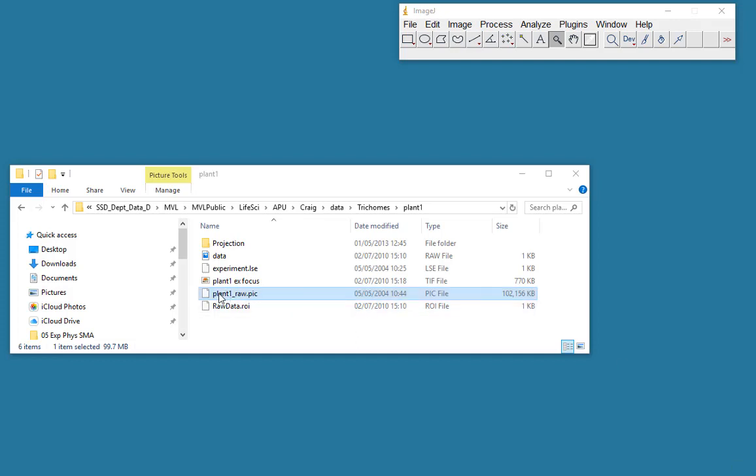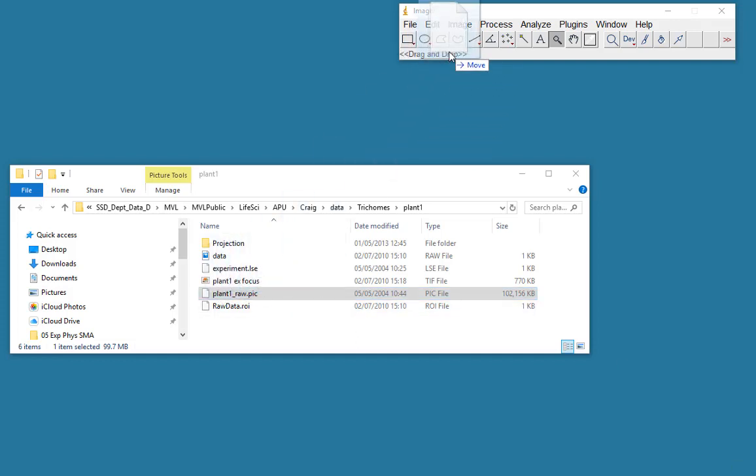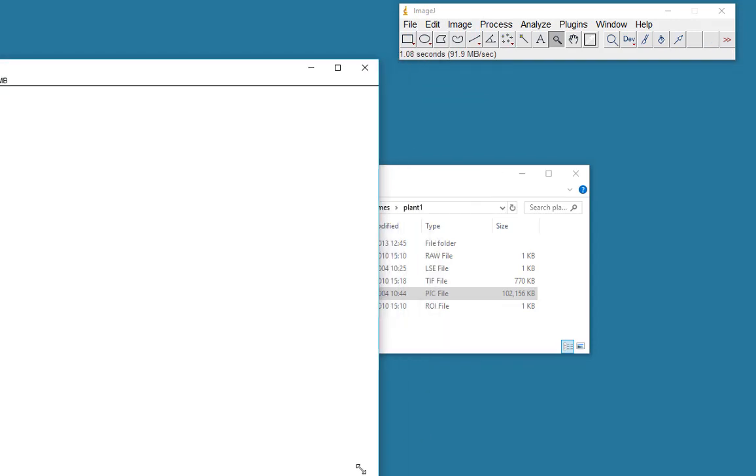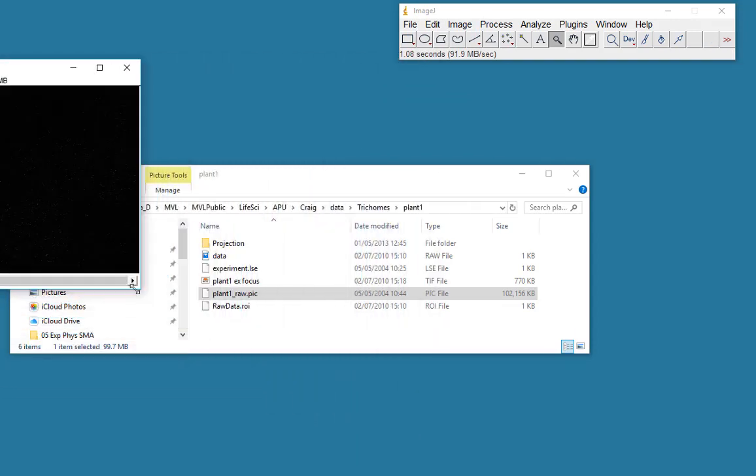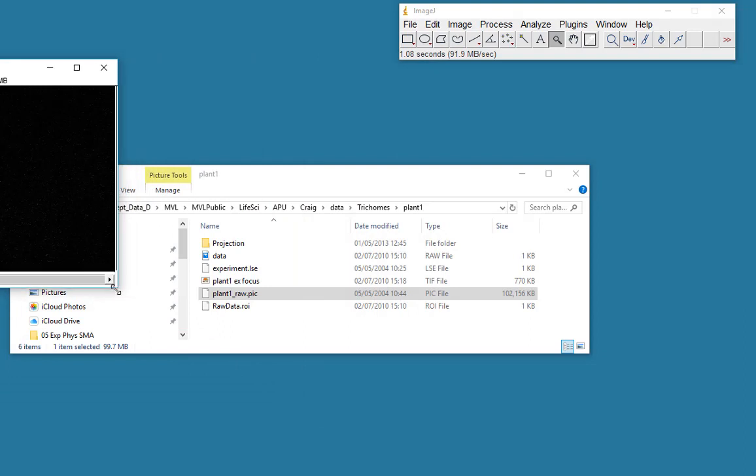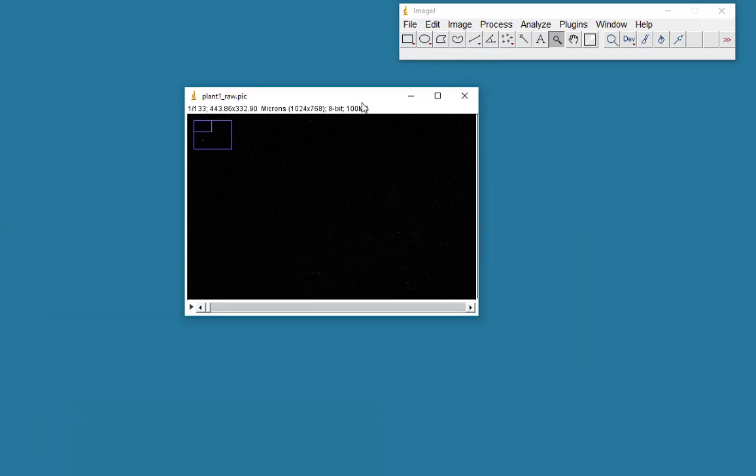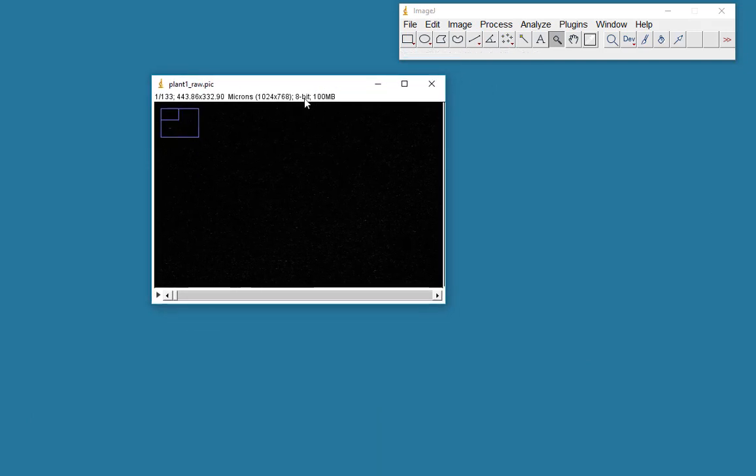I'm going to use this plant data set. It's a trichome from the underside of a fern which was embedded in amber. The image you can see here is quite large, 1024 by 768.